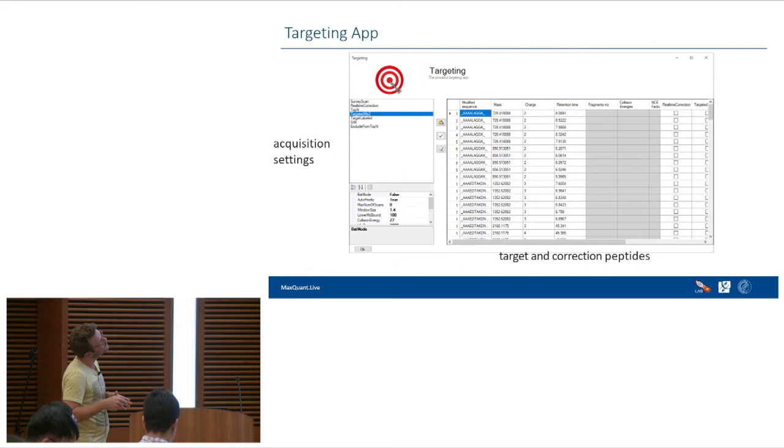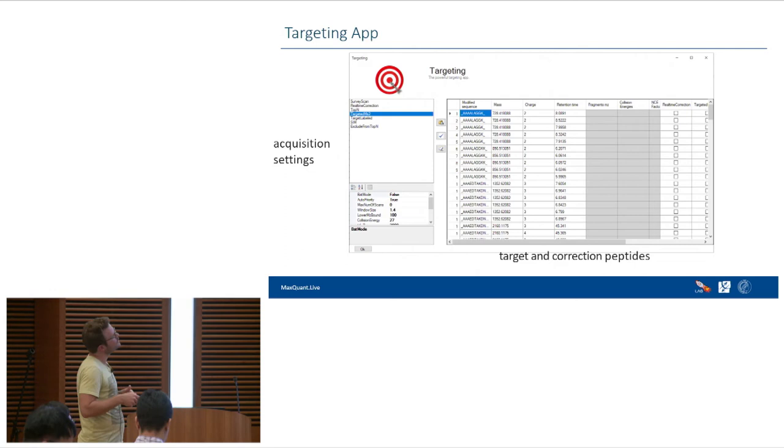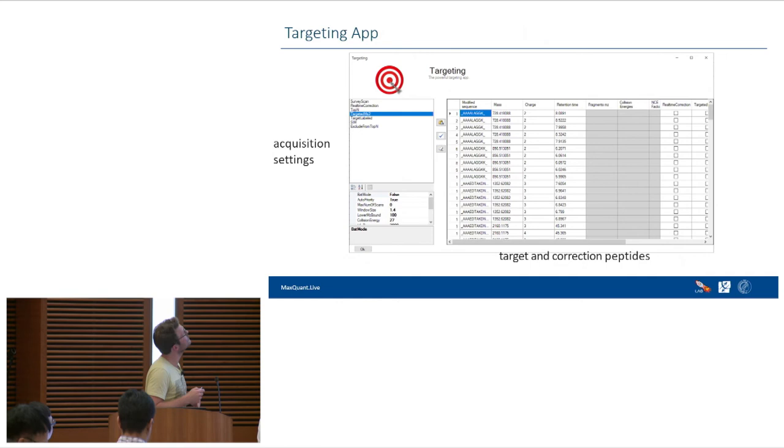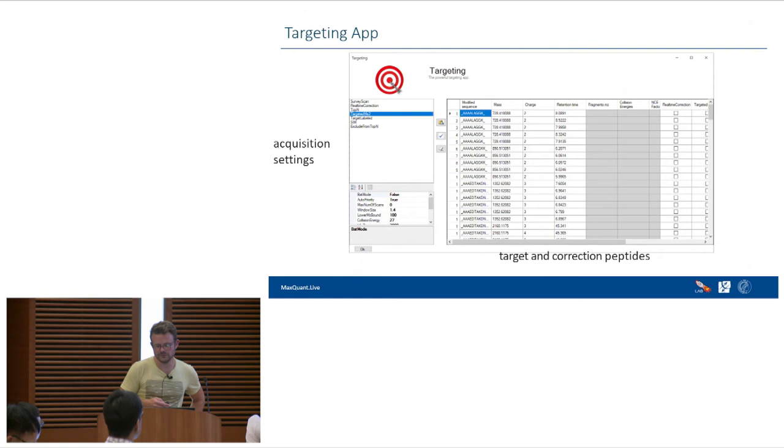So this is how you expect a targeting app to look. So we have a list of peptides which can contain target or correction peptides, and on the left there is all the settings for the acquisition strategy.